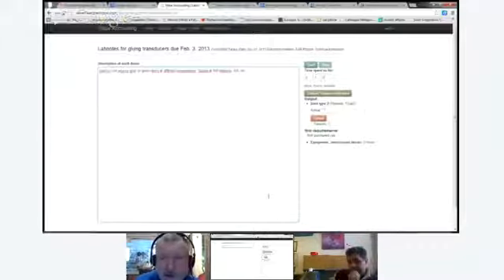It won't lose data, but it's not very good at having more than one person use it at the same time. So if both of you are using it sometime this week, I'm going to get you into an industrial strength database, and all the data will still be there.